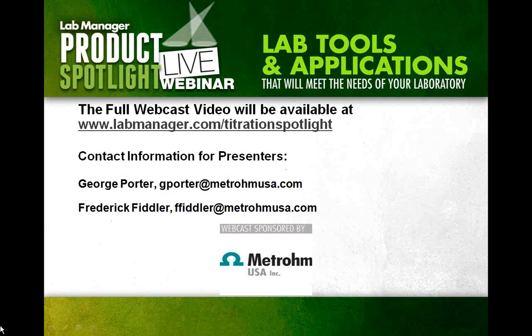Yes, probably. And what about the similar question with sulfide or sulfite? Actually, that's similar. We can determine both sulfide and sulfite concentration with different orthogonal techniques. That's one of the nice things: it's really easy to chain two titrations together, or even two separate techniques. And we see that a lot with our customers. They have multiple components, and these methods are usually rapid enough, a couple minutes apiece, that you're not using a lot of time to have two separate analyses.